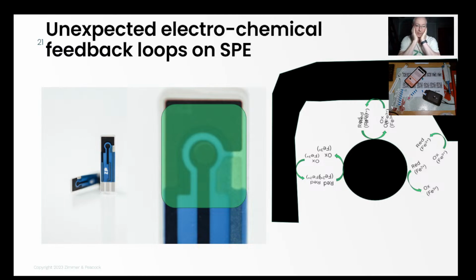And in fact, I have talked to other scientists, and I have done this myself, where you're doing amperometry and the signal's dropping off in a Cottrell fashion, and then after some seconds the signal comes up a bit more. And that's actually because the material is starting to arrive back from the counter electrode to the working electrode. So I have seen that, especially in these kind of ferrocyanide systems.